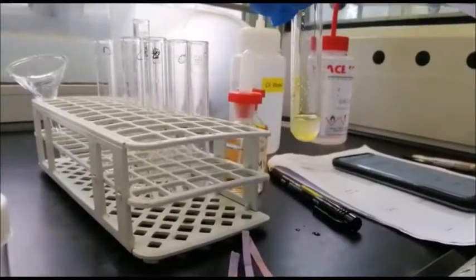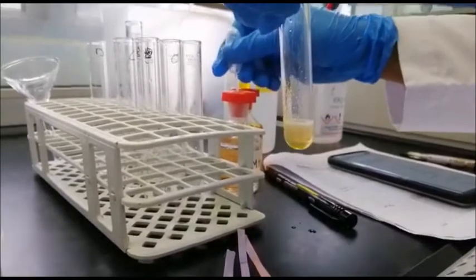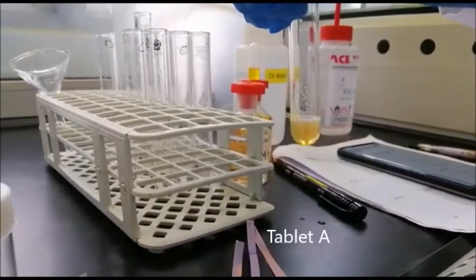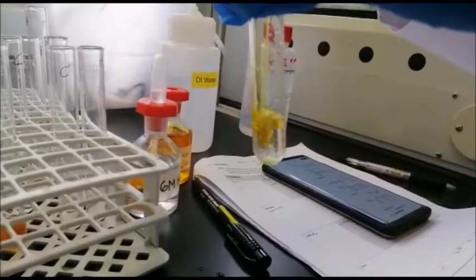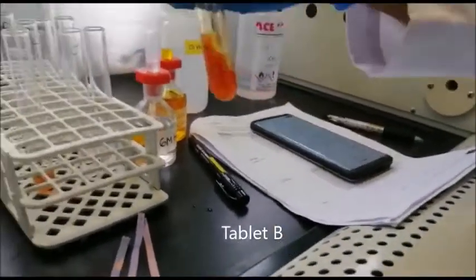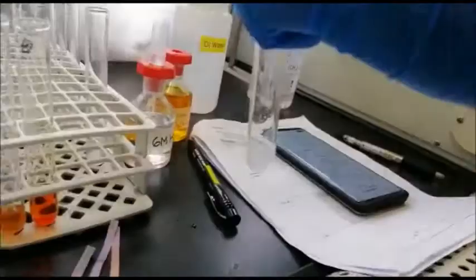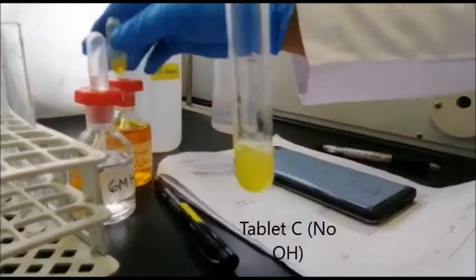Lastly, we used the ceric ammonium nitrate test, or CAN test, to identify the drugs with alcohol groups so as to provide a positive test for loperamide. For tablet B, it changed from a yellow to a red, implying the presence of an alcohol group. For tablet C, the solution remains yellow, confirming it is aspirin. However, this test resulted in 2 discrepancies.